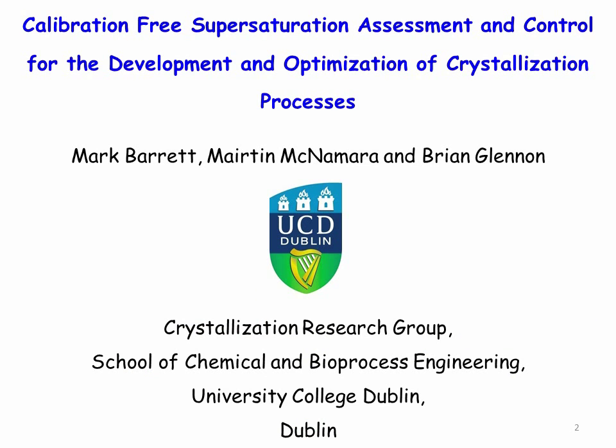The work presented during this webinar has just been submitted for publication to Chemical Engineering Research and Design, and hopefully will be published early next year. We felt that mid-IR as a technology was certainly underutilized with respect to crystallization optimization, development and scale-up, certainly from an industrial perspective. These calibration models, which are very well defined within the literature, have yet to transfer into the daily development of crystallization processes within industry. So hopefully we have produced a more qualitative method, which is a bit more rough and ready, but certainly enhances process understanding with respect to supersaturation assessment.